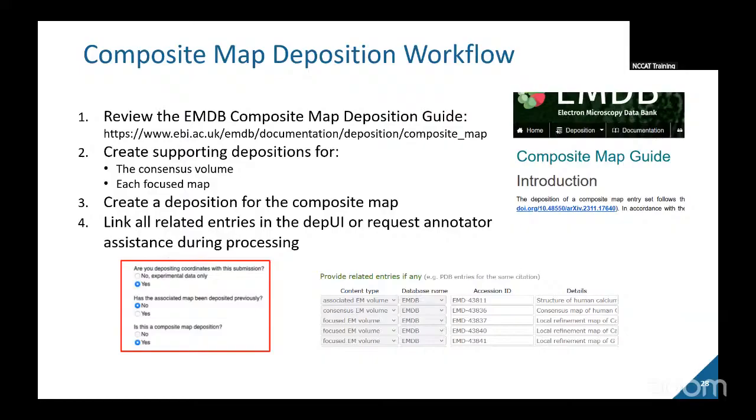It would be useful to have something more relationally focused, where you could see there are these different classes that are part of the same experiment from the same sample. So you've got a hierarchy where you've got your data set, your 3D classes, and then your sub-particles, your sub-volumes, effectively, from a composite map. It would be useful if there was some way to display that so people can actually see what's going on, because it can be hard to correlate between what's on the EMDB and what's in the paper.